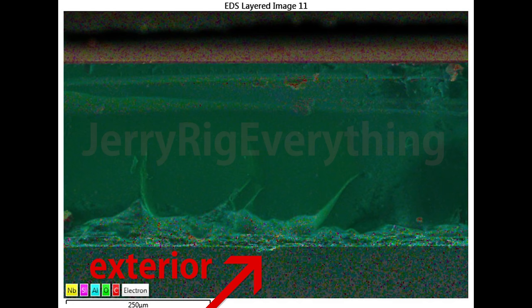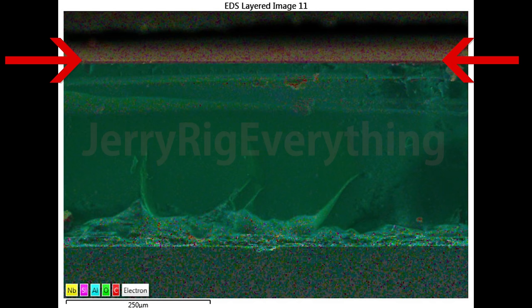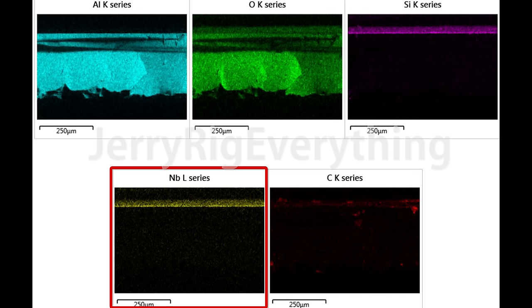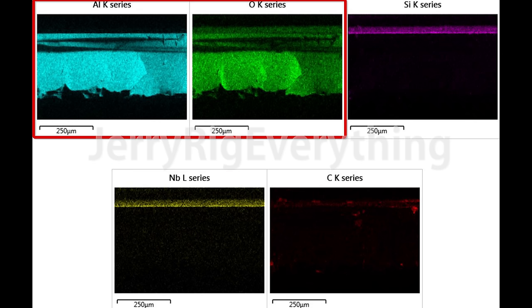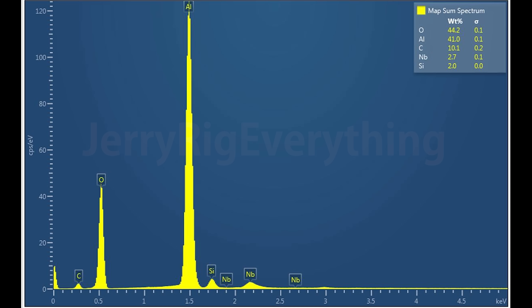Let's look at another segment. The exterior side is aluminum oxide; the interior coating is niobium and silicon. Niobium improves the refractive index of optical glass, allowing for thinner and lighter lenses, so that particular element appears intentional. The majority of the lens body is aluminum oxide — what we call sapphire — but there is quite a bit of carbon, and that is the main impurity. The quantitative graph confirms the carbon is still a decent sized chunk, while the niobium and silicon are just on that very tiny inner layer.